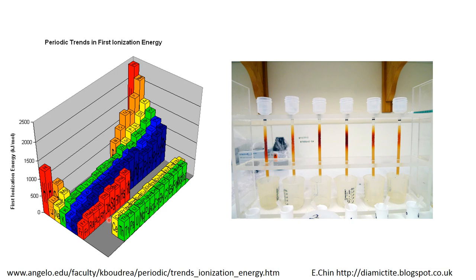Okay, so quite often the isotopes of strontium and the isotopes of neodymium are measured by thermal ionization. And this thing over on the right is just to show one of the methods we use to separate out all of the other elements from the element we're interested in. So this is chromatography, these are chromatography columns. These work in much the same way as a gas chromatograph or liquid chromatograph.